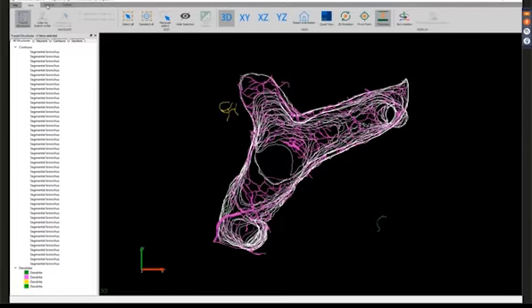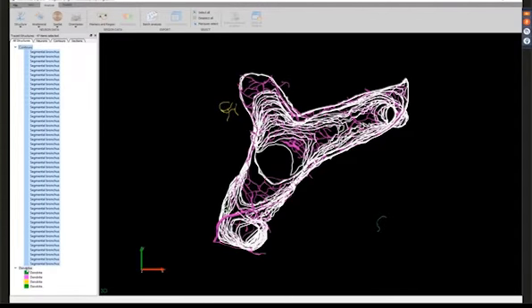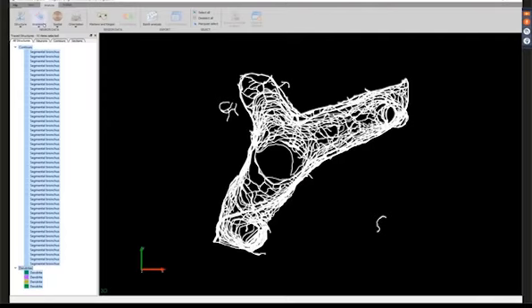You can see that in the Analysis tab of Neurolucida Explorer, there are many different types of analyses available to you, and you can combine them based on what metrics you would like to obtain. In this demonstration, I'll show you how to obtain measurements about the processes enclosed in a 3D structure using closed surface analysis. We can use these metrics to answer the question, what is the density of fibers enclosed in this section of segmental bronchus? The first thing that we'll need to do is select the contours that make up the segmental bronchus and the dendrites that we traced throughout the whole image.